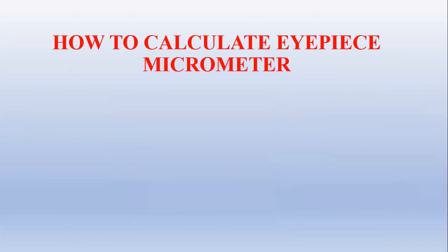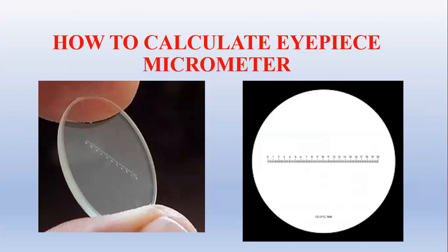Today we see how to calculate or perform calibration of the eyepiece micrometer. This is your eyepiece micrometer — we have to place this eyepiece micrometer into the eyepiece of the microscope. The second slide is there, which has a scale that is not calibrated, so calibration of the micrometer is required.